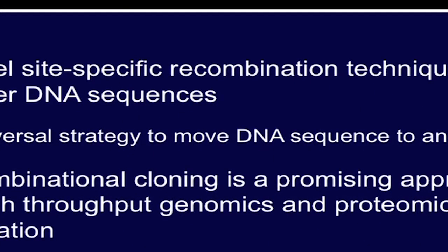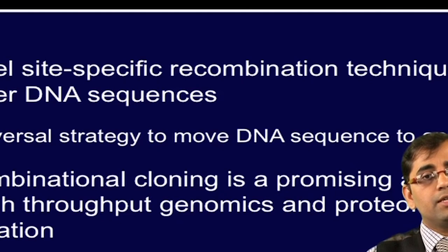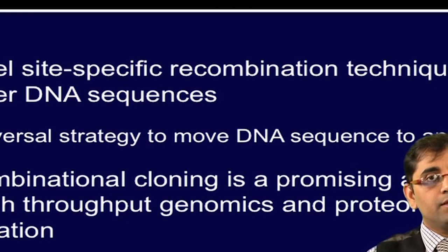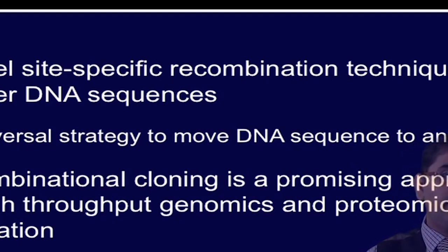As mentioned, recombinational cloning is a novel site-specific recombination technique which is used for transferring DNA sequence between vectors. The specific recombinase enzyme cleaves the DNA backbone and carries out the exchange of DNA between its specific sites on two different molecules. This is a universal strategy to move a DNA sequence to any given vector. This is a very promising approach, especially when one looks for high throughput applications in genomics and proteomics.